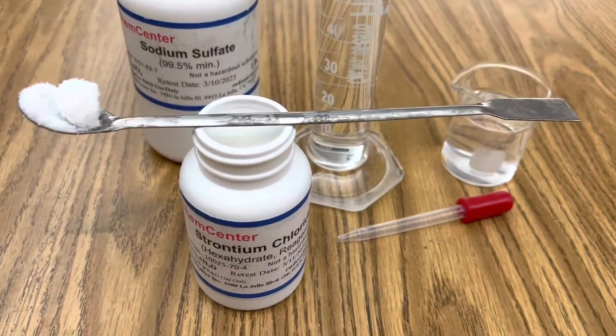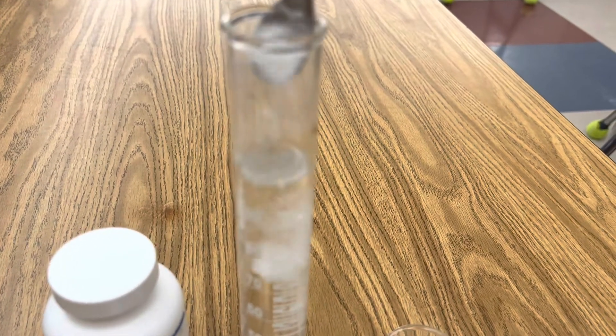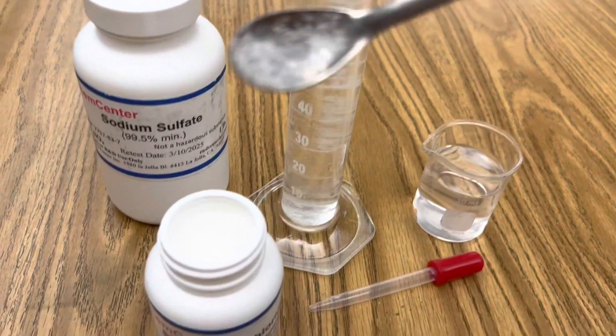Next add 8 grams of strontium chloride to 100 milliliters of distilled water and stir the solution until it's aqueous.